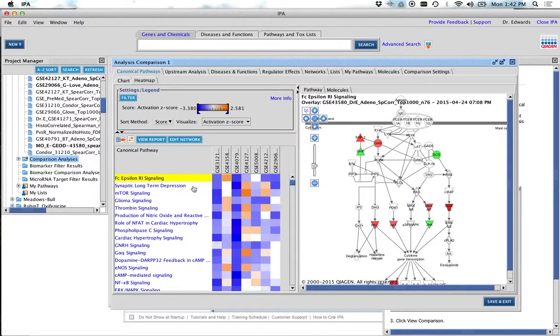Basically, what's going to happen is all of these things, remember, this is all just probabilities. All of these studies kind of pick this one out, except this one, as being overrepresented. When we click on each individual, so there's yours, BT, which had the strongest inhibition, you can see some of the same things light up. Isn't this cool? I think this is so awesome.